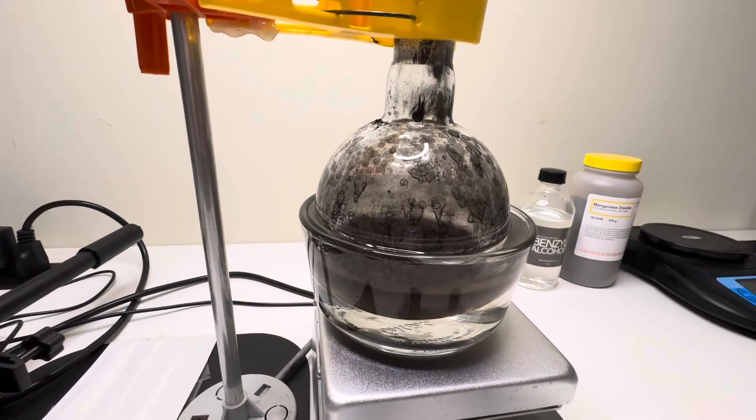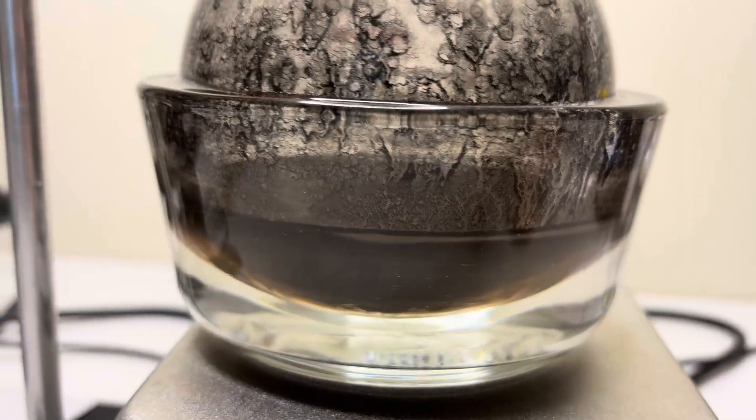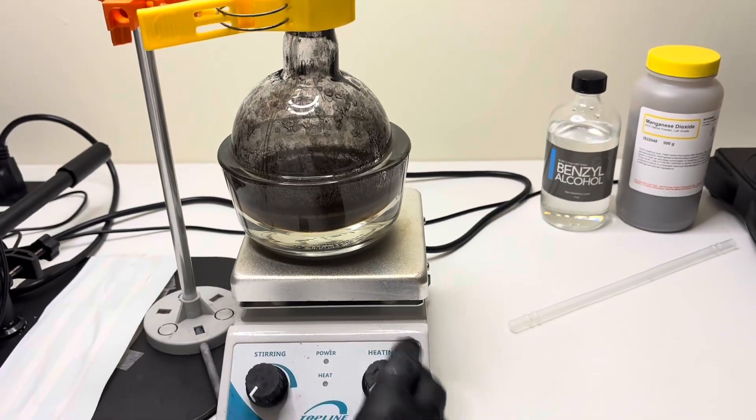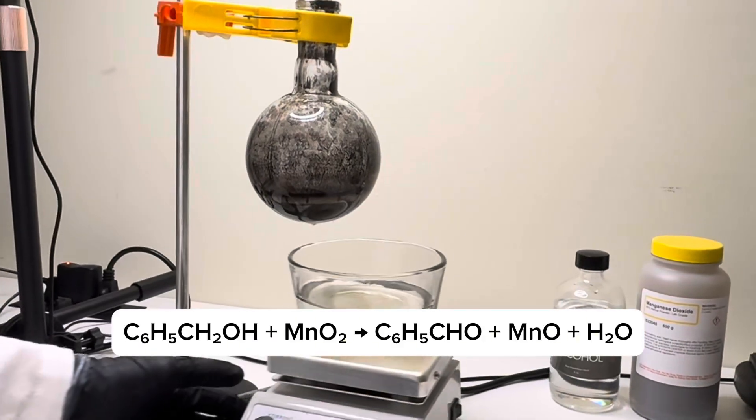Chemically, what's happening is an oxidation reaction. The benzyl alcohol is being oxidized by manganese dioxide. It targets the primary alcohol group and converts it into an aldehyde.